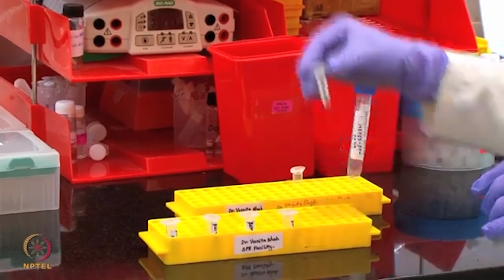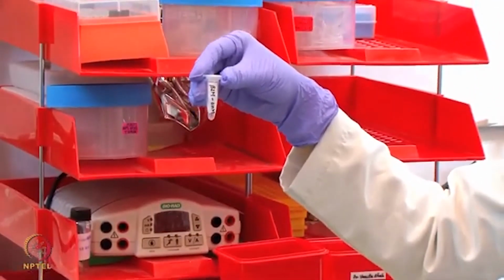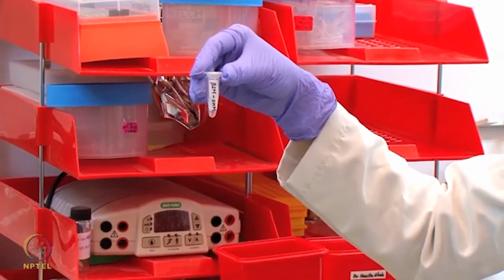We will also include 0 nanomolar concentration in the experiment, which will be nothing but the running buffer.